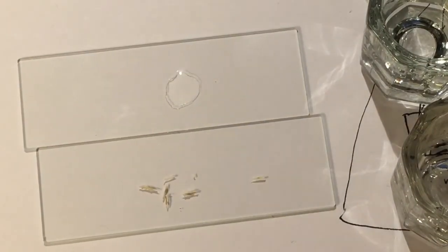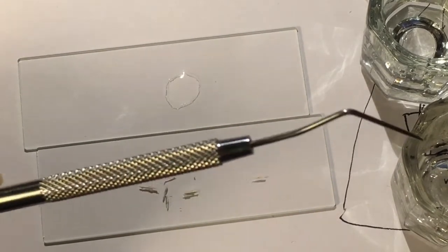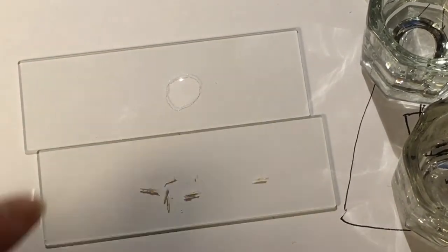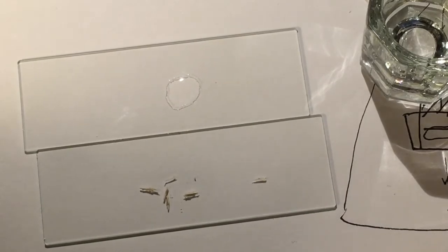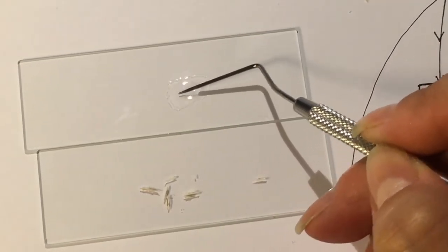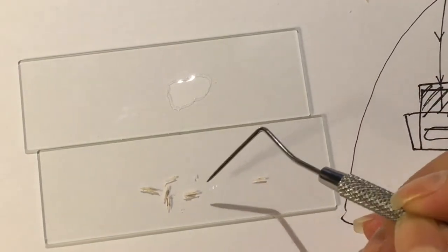One way that you can avoid going from grabbing your section into 80% ethanol, then grabbing your sample, going into water, then picking it out, placing it on your slide, is to actually just work directly on the slide. So I've put a droplet of ethanol, and I'm going to use that same ethanol to pick up the samples. And I want you to observe how they increase in size dramatically.